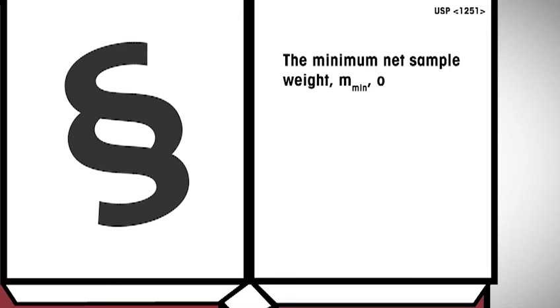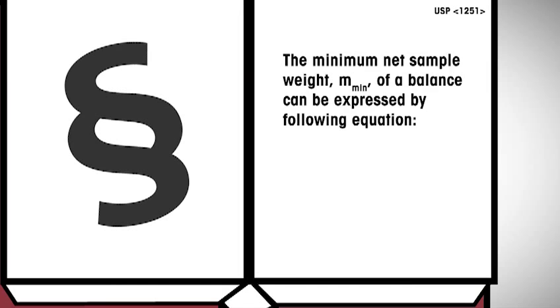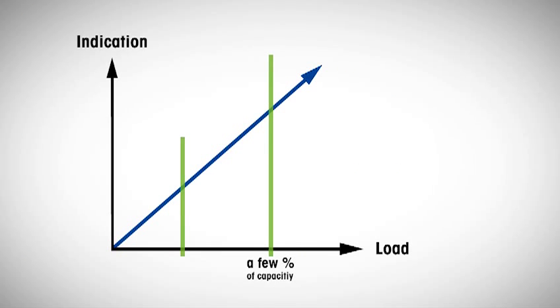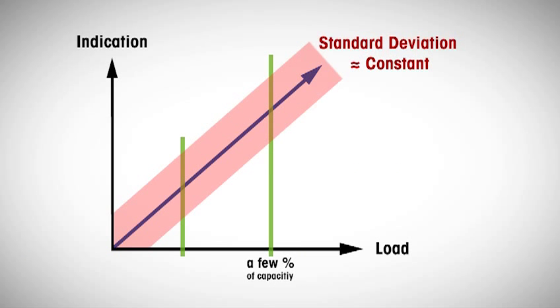The last thing you should know about the new USP weighing chapters is how to avoid weighing errors. The minimum net sample weight of a balance can be expressed by the following equation. We have already seen the Chapter 41 criteria for repeatability. Solving this equation for the mass yields that the minimum weight must be equal to or larger than 2000 times s, the standard deviation.